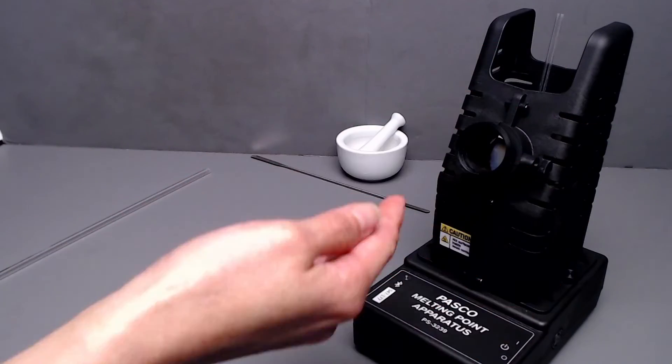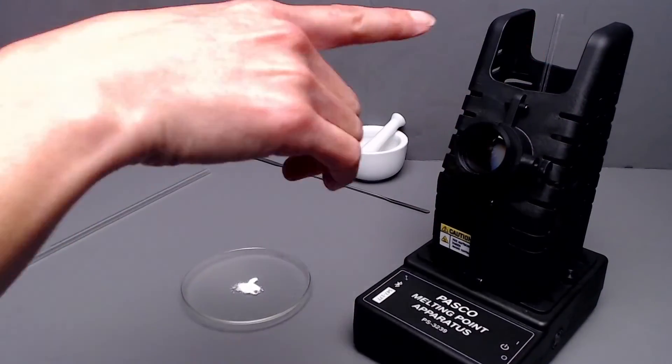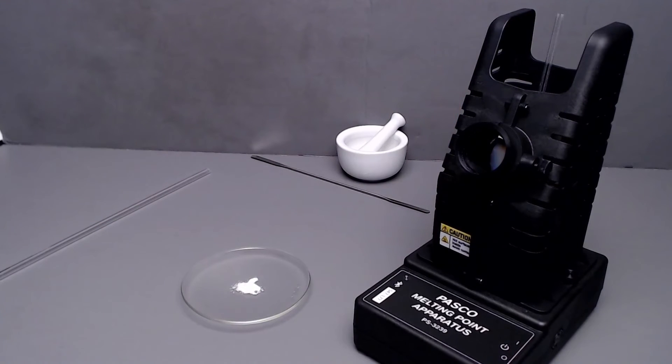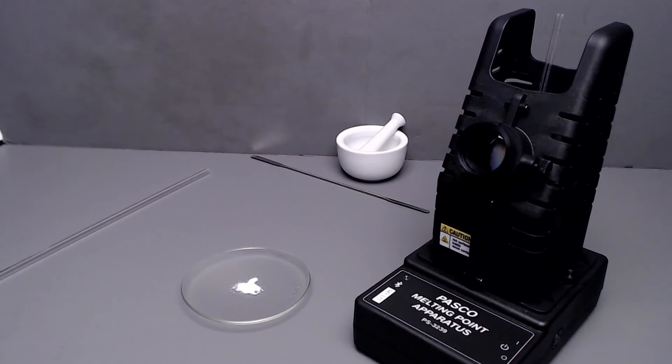You can either use the capillary tube open. The only time you might worry about sealing that capillary tube is if you have a sample that sublimes easily before the melting point. If that happens, you can always take a Bunsen burner and seal it closed. Otherwise, you are ready to use the apparatus with open tubes.